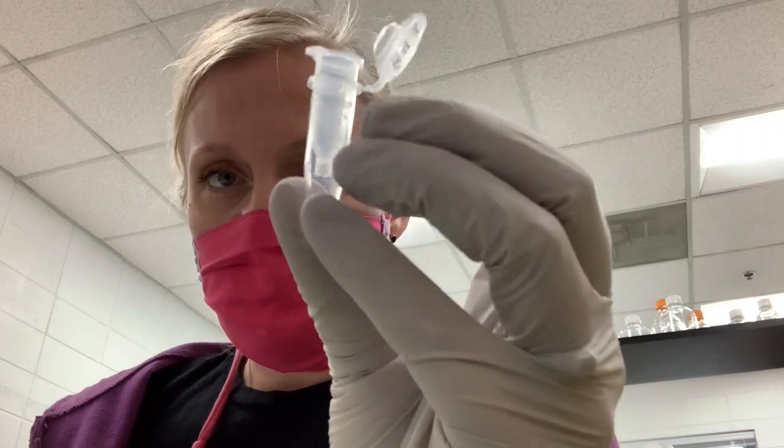And I'm again using just one tip because I'm being very careful not to contaminate it, because I don't want this RNase-free water to be contaminated with any of my samples. If you touch any of the tubes, get a new tip. I'm going to let these sit, so you might be able to see there's just a little droplet of water right on the filter in each column. I'm going to let them sit for about 1 minute. You might need to tap them just to make sure the water gets down to the filter. If you look down, the beads of water on the side of the tube, you can tap them. I'm going to set a timer and wait for 1 minute, and then I'm going to go to the centrifuge.